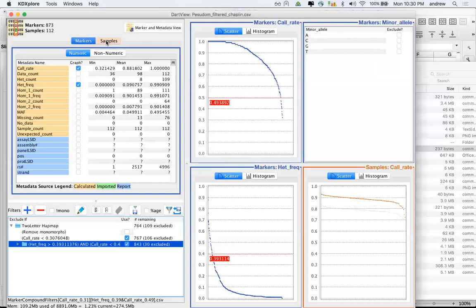It's a good question. At the moment, we only have a feature to export to a plain text file. The assumption was that this file would be taken and then uploaded back into GOBii. We can definitely have a look at extending that to automatically upload to a breeding system.